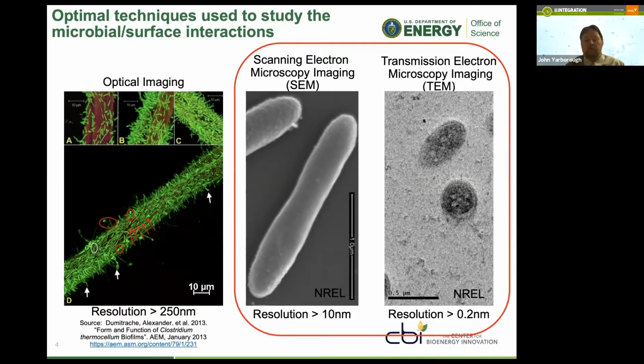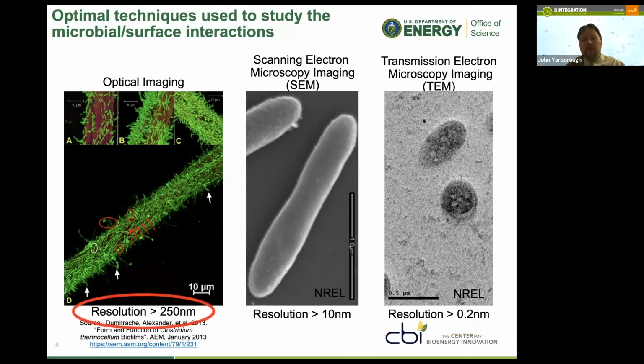So now you've gone from a native environment to very sophisticated, complex sample prep that then puts them into a vacuum atmosphere to try to do the imaging. So the question is, how can we get past this without using electron microscopy? Can we use optical techniques to push us beyond the diffraction barrier of light and closer to the actual resolution that we see with electron microscopy? And we can.